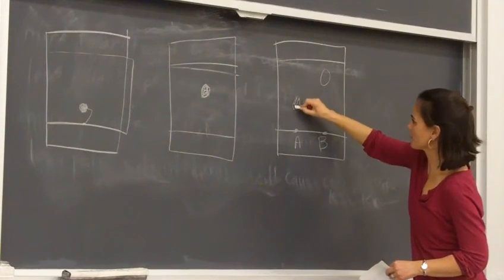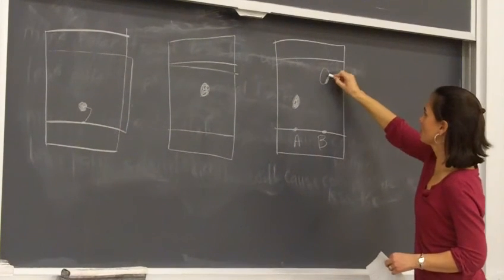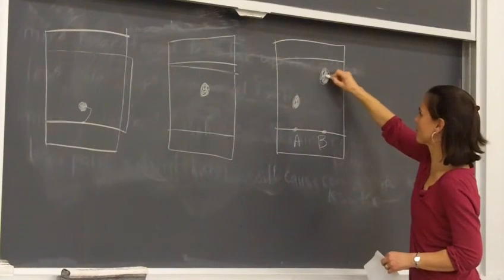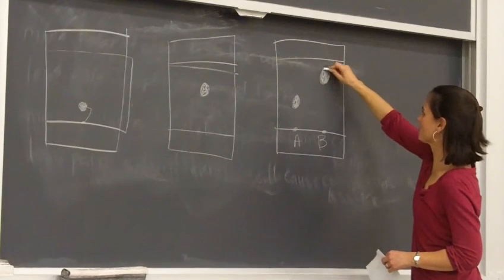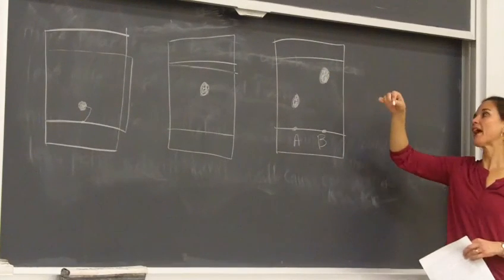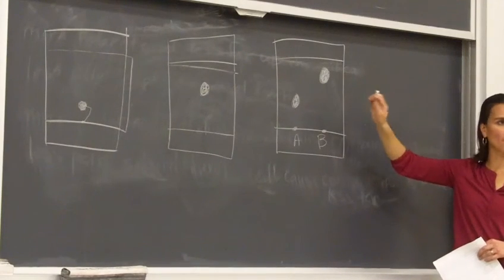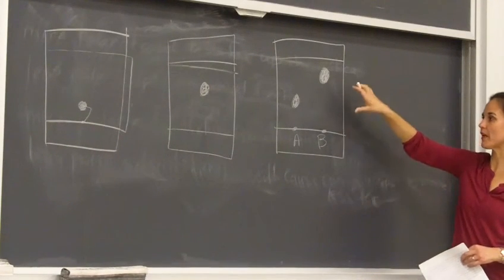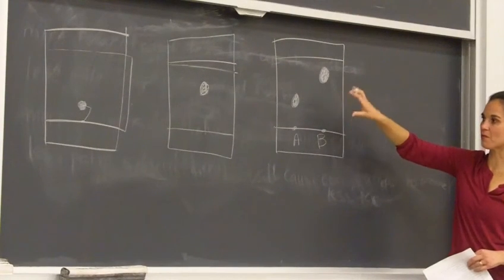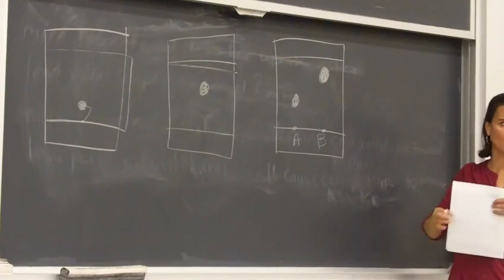A. What is the less polar spot? B. Okay. So keep all of those things in mind as you're thinking about thin layer chromatography, this week's experiment and explaining it, and also for the quiz. Think about how the polarity of the compound is related to what RF value it will have versus the polarity of the solvent, and how that changes things, because you've got two different things going on.